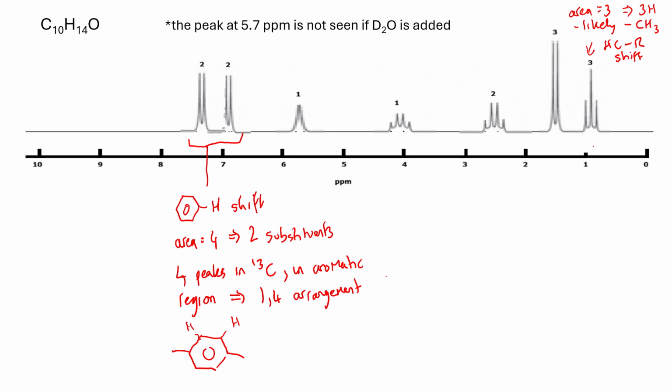So let's note that down, and that remember tells us that there are 2 hydrogens on the adjacent carbon. So based on that, we can now say that we have this kind of structure somewhere in the molecule.